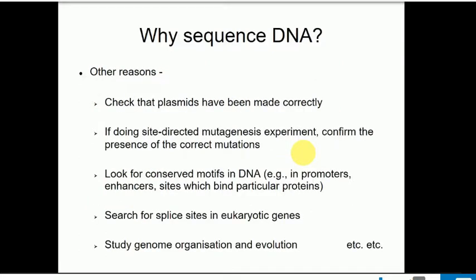There are many, many other reasons why we want to look at gene sequences. If you're just doing standard cloning in the lab, generally speaking, if we're making plasmids these days, we'll resequence them to make sure that we've put things together the right way. If you're doing mutagenesis, if you're changing bases to other bases, you're going to need to sequence the gene to check that you've made the mutation that you think you've made.